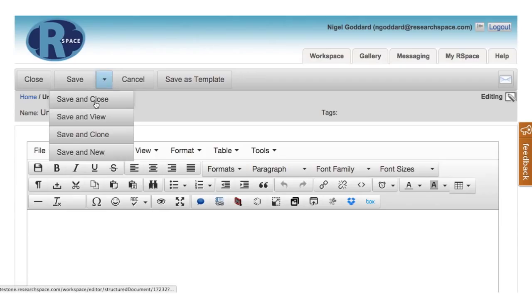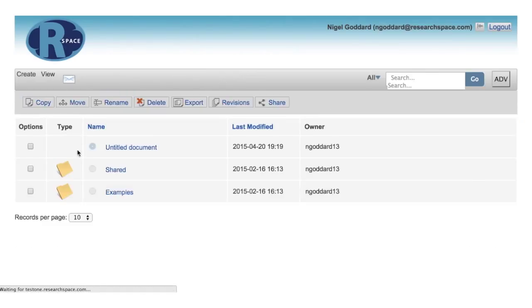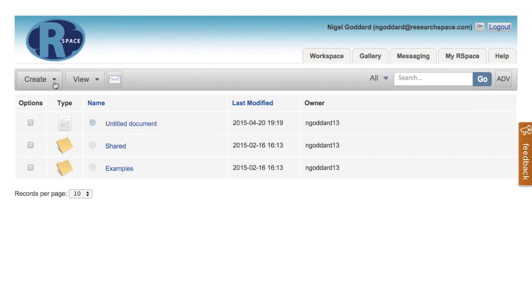We can save and close it, and there it is, it's untitled at the moment.